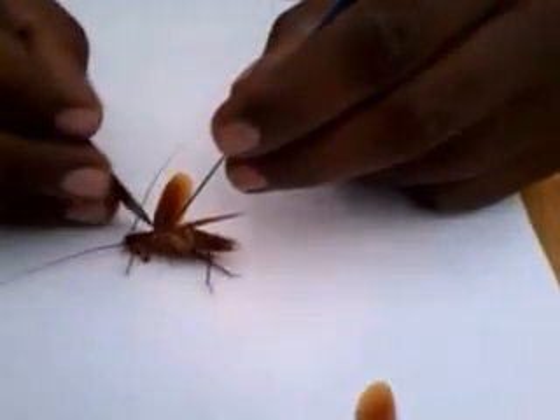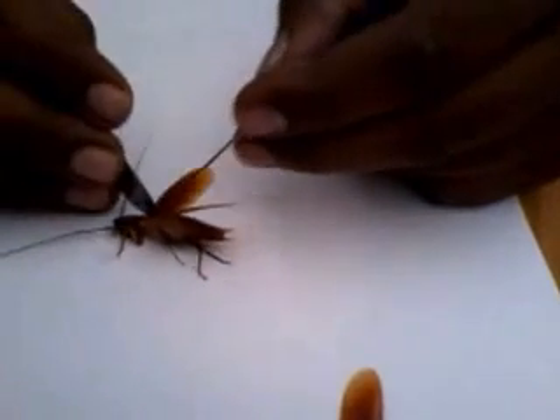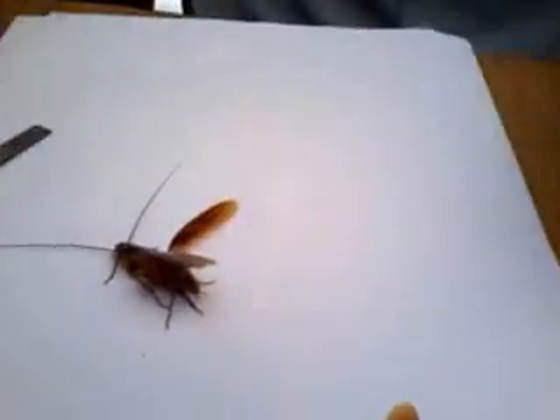Actually, we should use scissors, but as scissors are not available I am using this alternative tool instead.